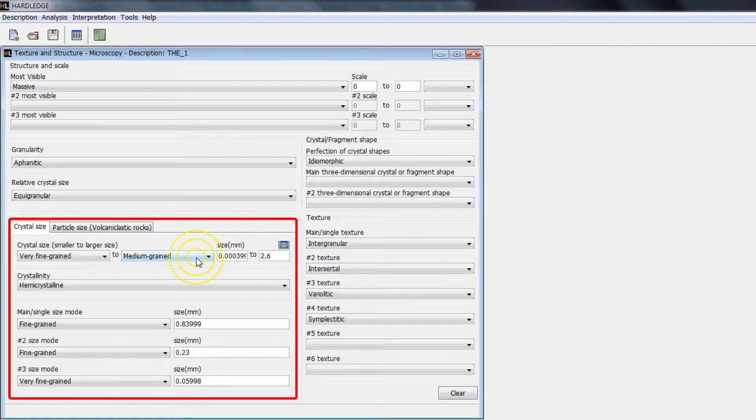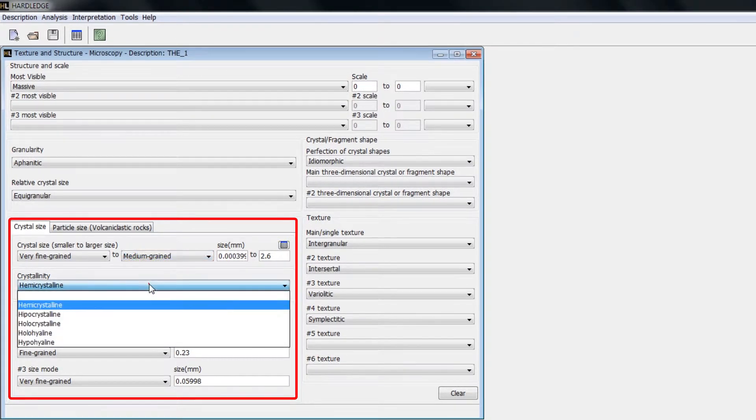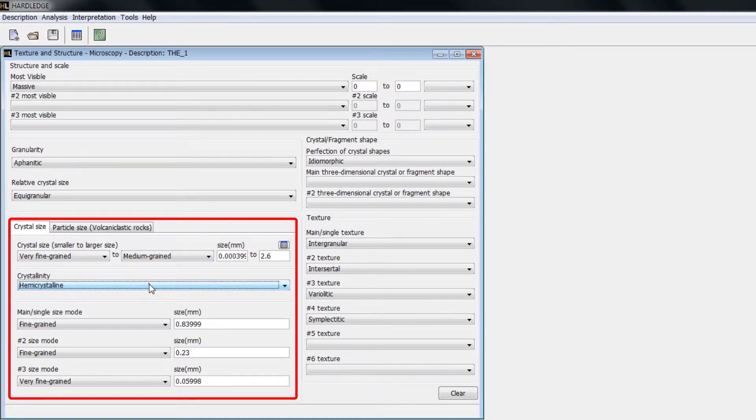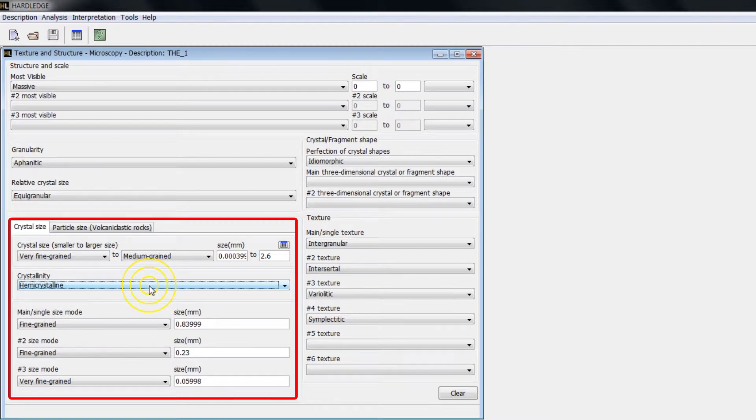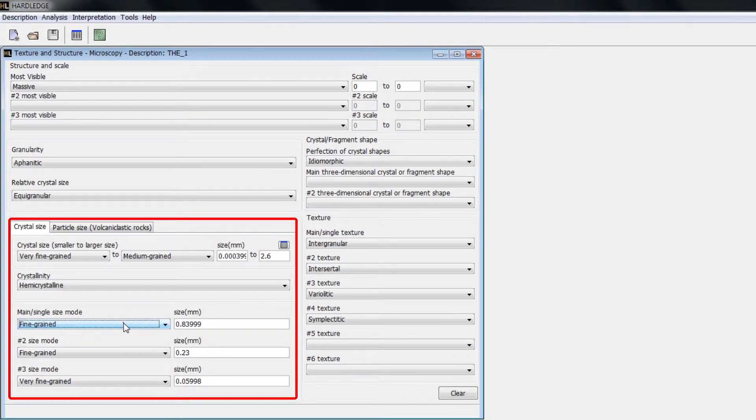In Crystallinity, select the desired crystallinity degree. In Main Single Size Mode, select the mode size of the crystals. In case of bimodal samples, select the second and third mode size.